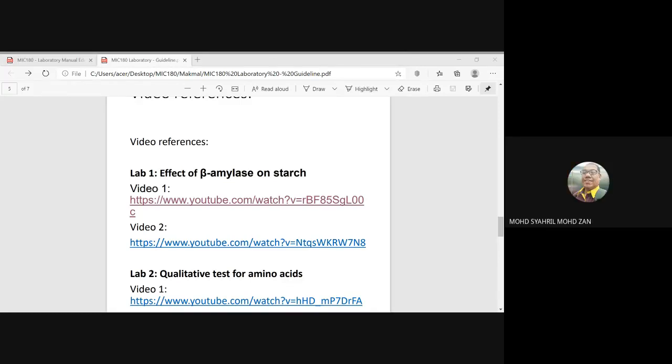Sir, the absorbance just now, is it on the y-axis? Absorbance, yes. Usually with the wording, like absorbance versus cm, or distance versus meter, the first word refers to the y-axis. The second word refers to the x-axis. Okay. Thank you.